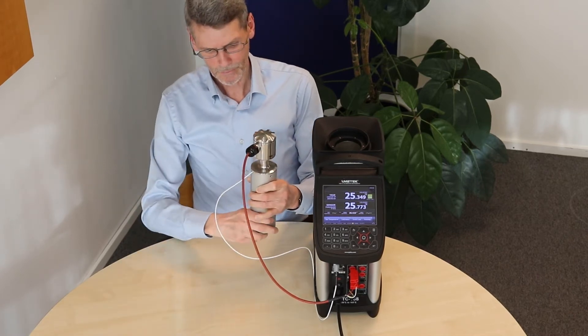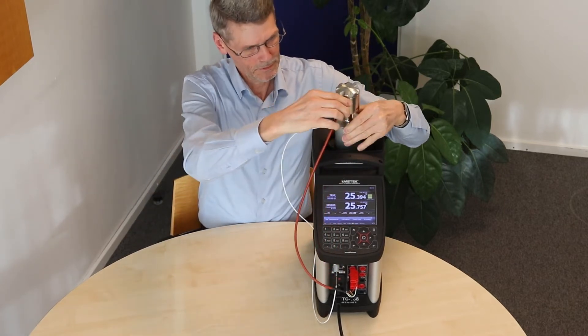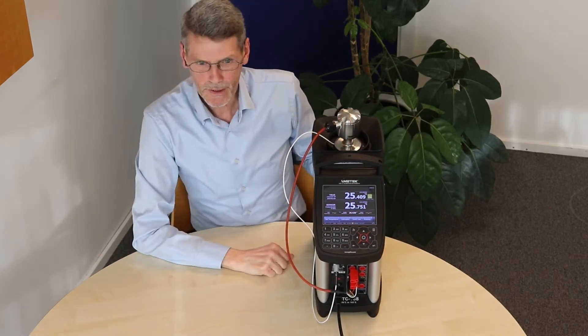Now it is ready. We can put it into the calibrator, and we can now set a temperature.